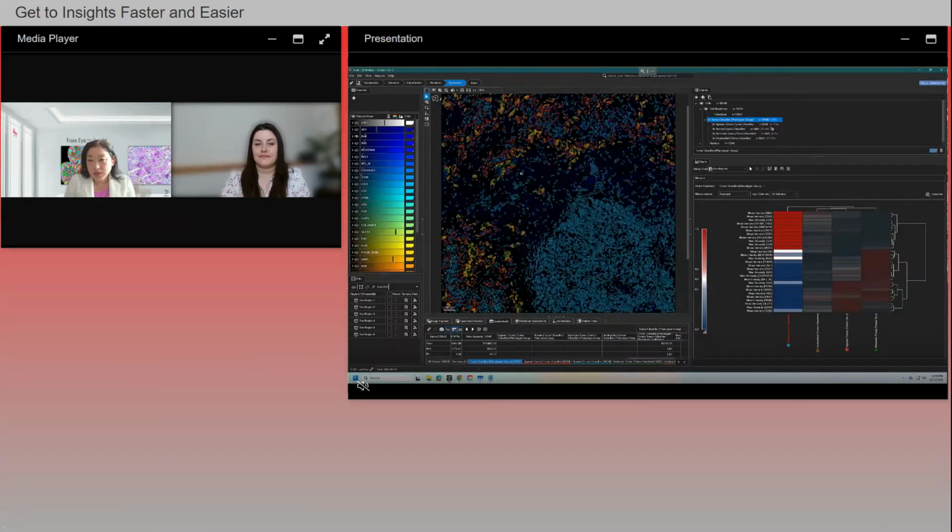Currently, the SBE interface you saw is single channel and single compartment, but in the next release, we'll enable multi-channel input and multi-compartment output as well. So stay tuned. We have many more exciting variations on this tool that we've just released.